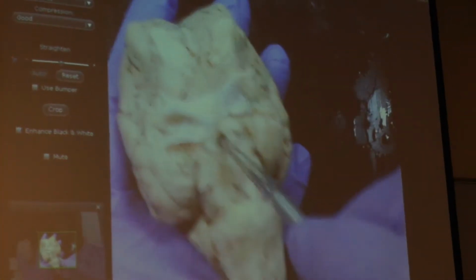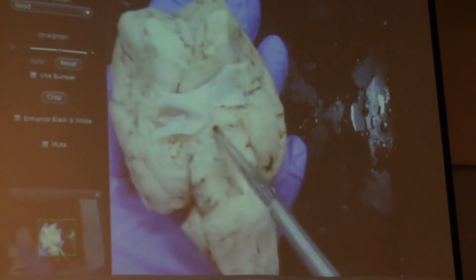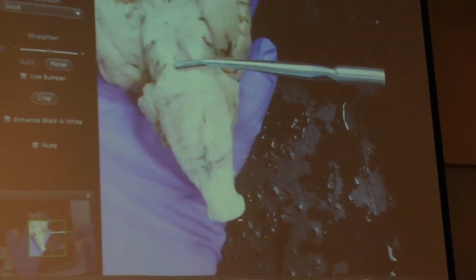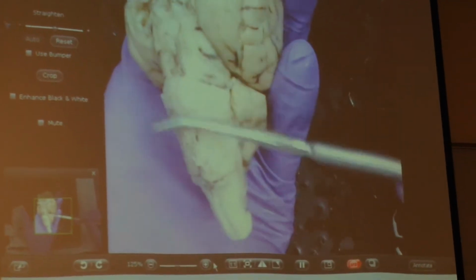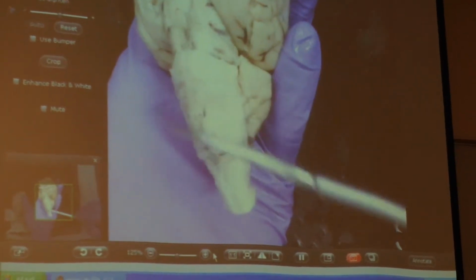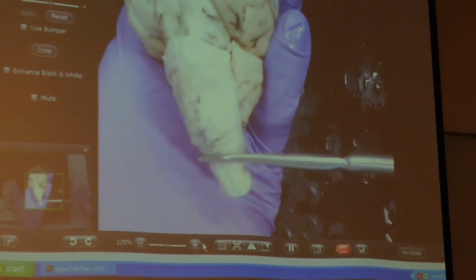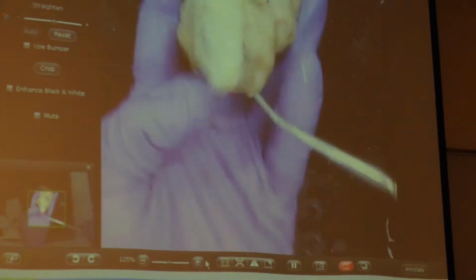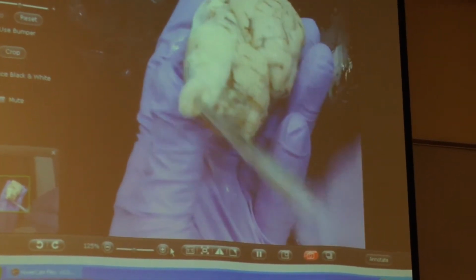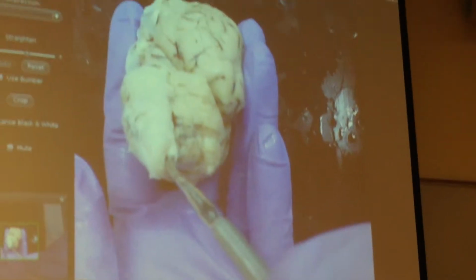This space is what we're going to call the third ventricle. We'll look at it on Monday. You guys will look at it as best as you can, but this is going to be our third ventricle. Can everyone see right here this first bump? I'll put it kind of on the side. What is that? Pons. What does this second bump represent? Medulla oblongata. And then what's this piece from here all the way to the spinal cord? This hole right here in the spinal cord, I can put my probe into it. That is what we're going to call the central canal of the spinal cord.